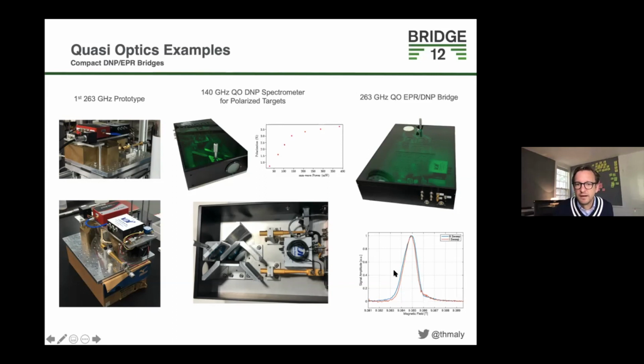And it shows that if you sweep the field or the frequency, you still get the same EPR signal. This is something you need to convince the EPR spectroscopists about. That's the same. With this, I stop.